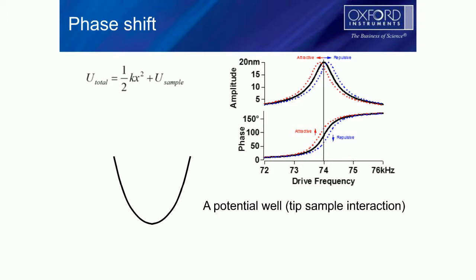Right? And we show this a lot. And what I'm going to try to relate to you is how this attractive and repulsive data, these shifts, what's the origin of these, and how can you use that to control and get accurate height data, right?